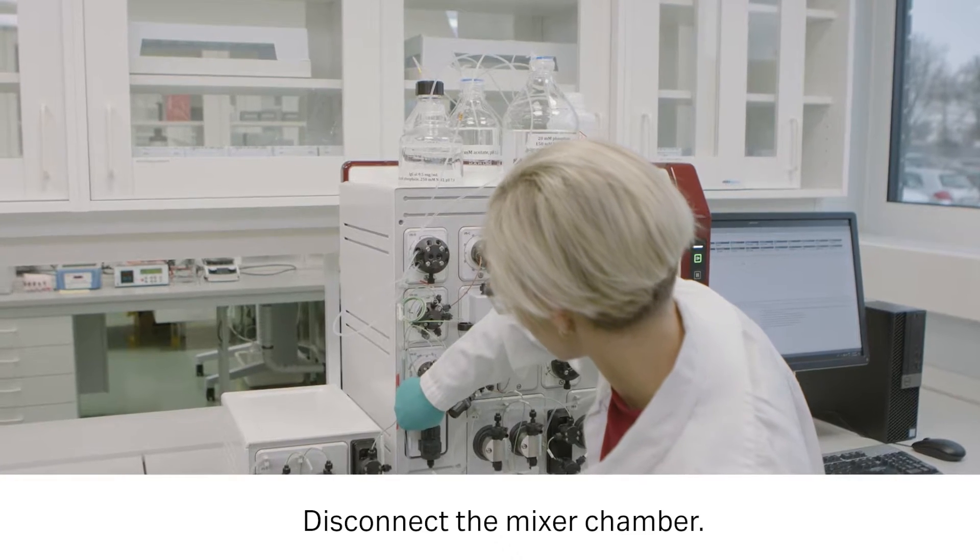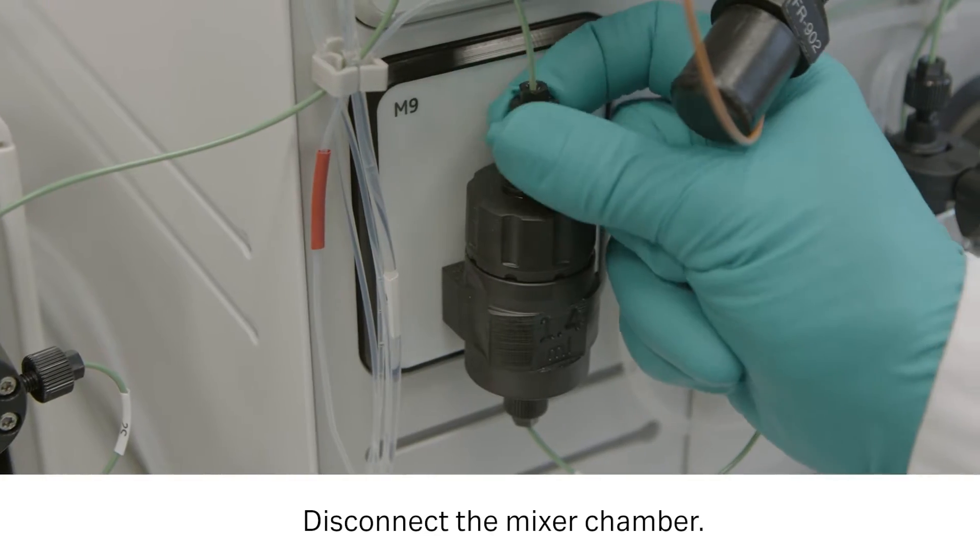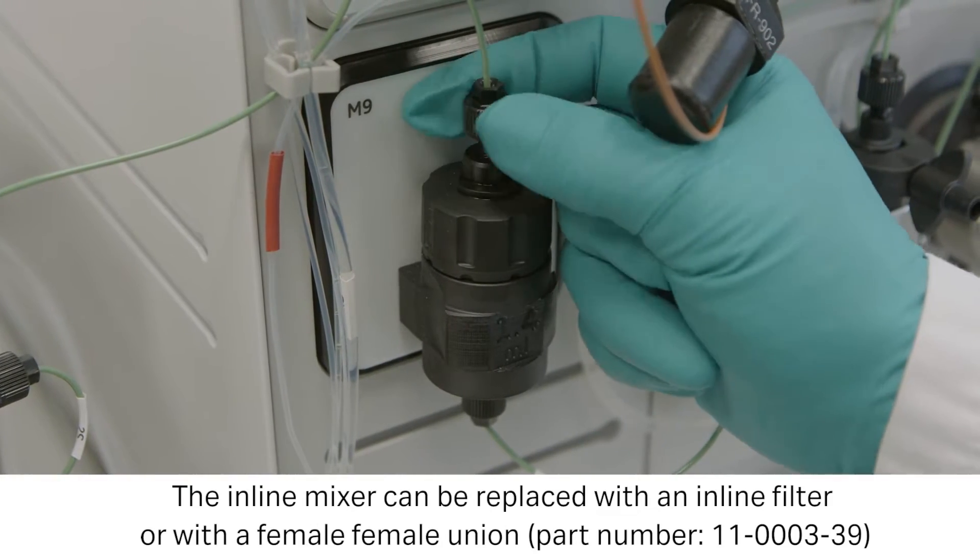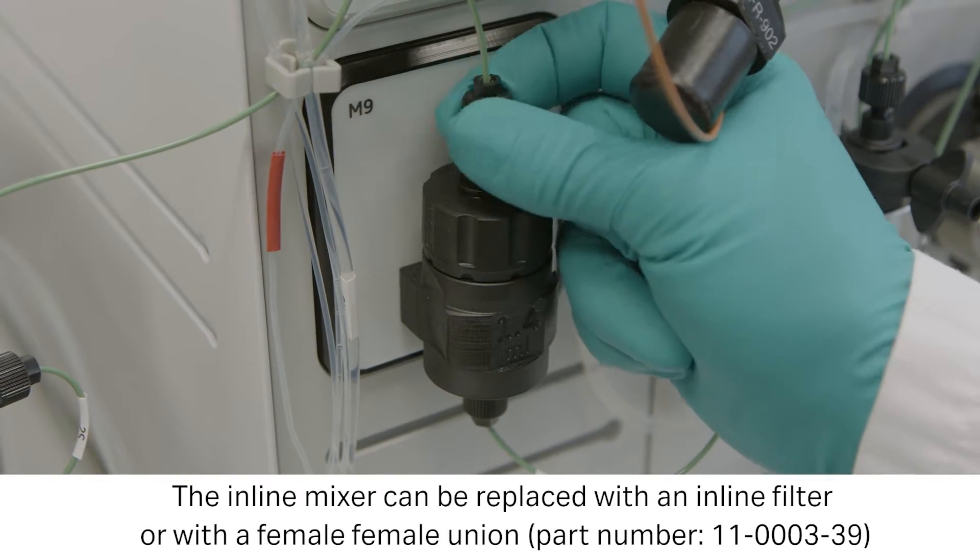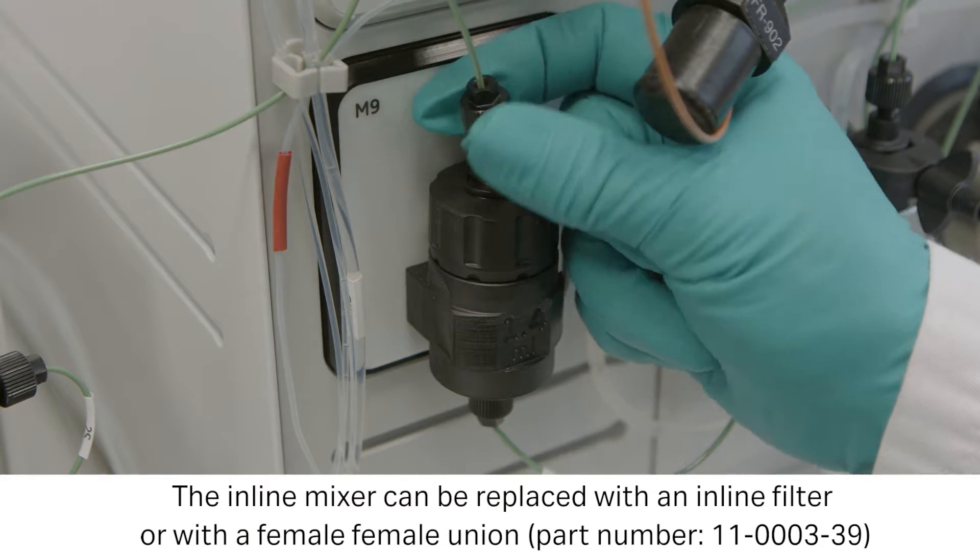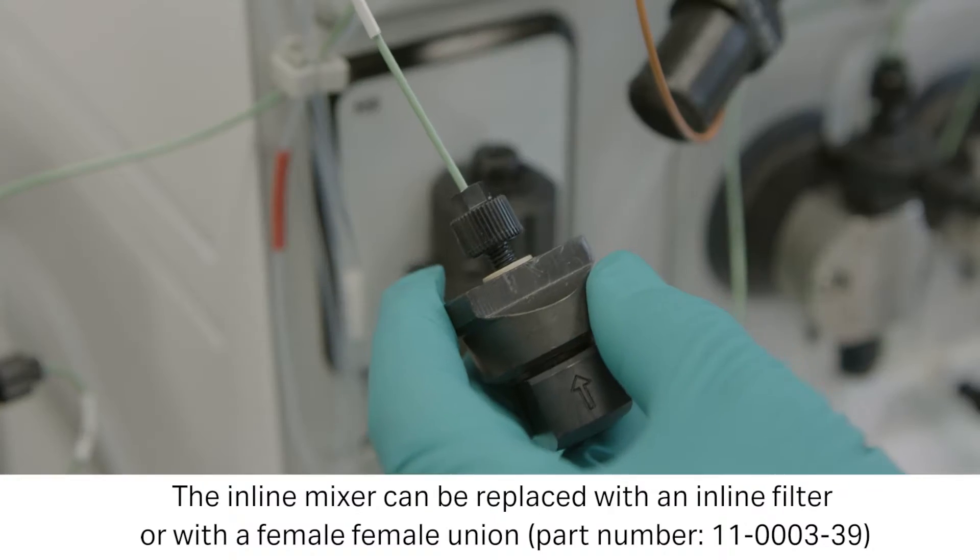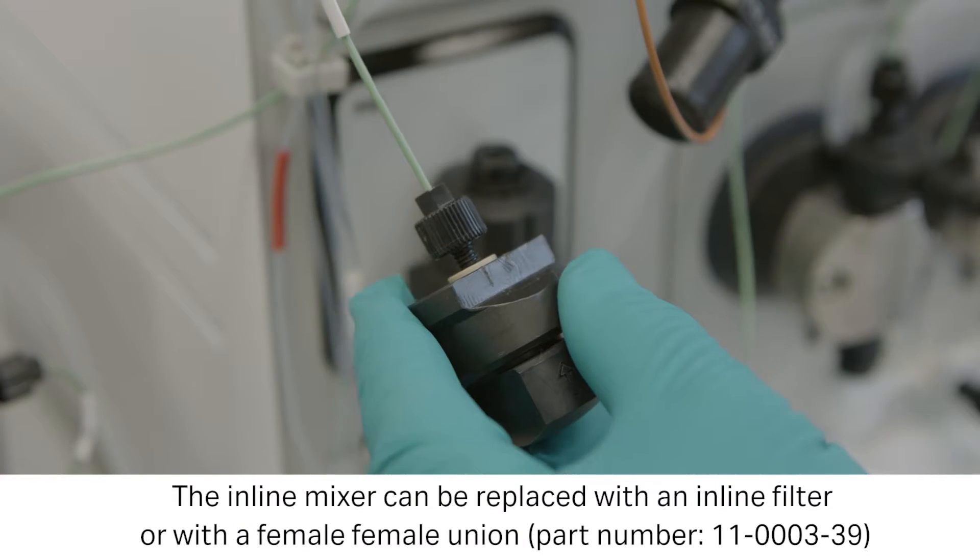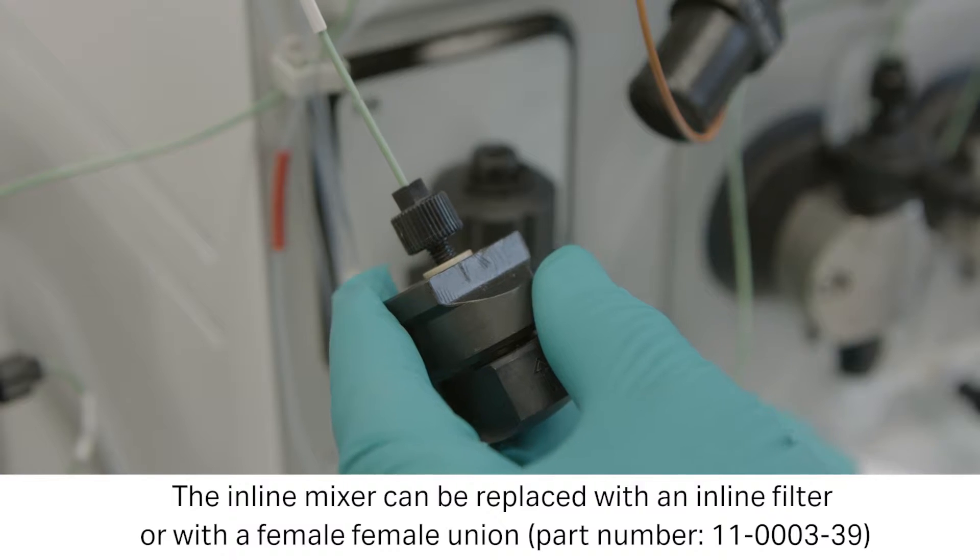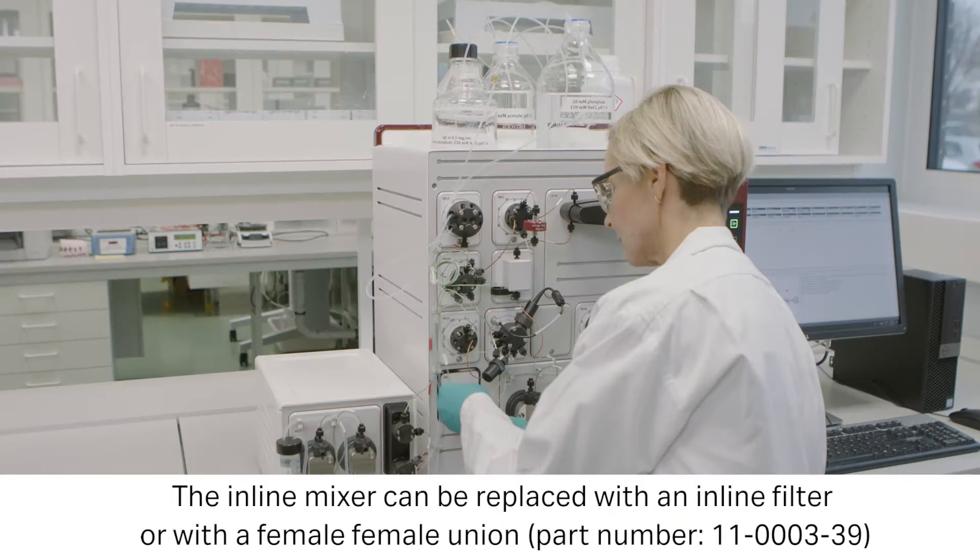The system dead volume is minimized by disconnecting the mixer. Gradient dilution is not used so the mixer is not needed. The inline mixer can be replaced with an inline filter as shown here or with a female-female union.